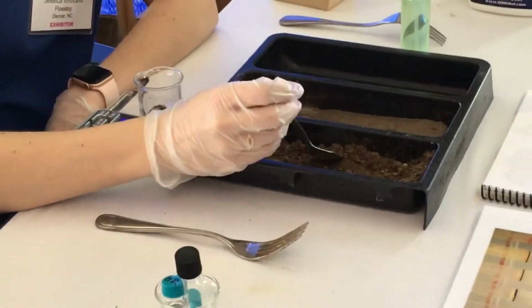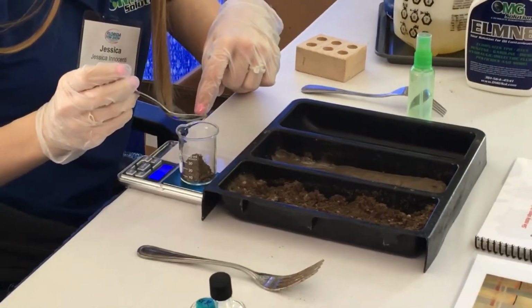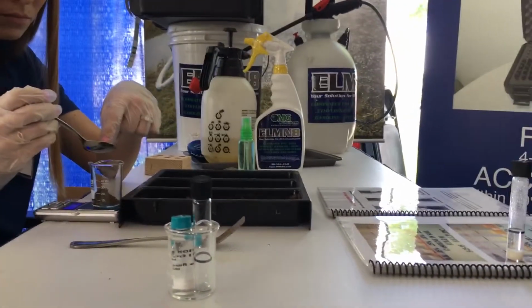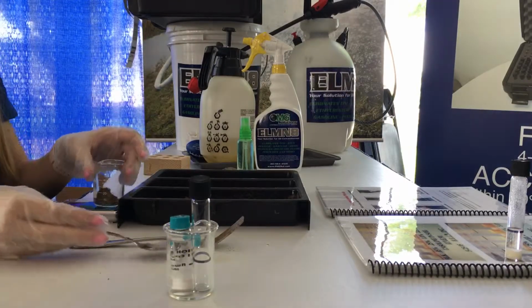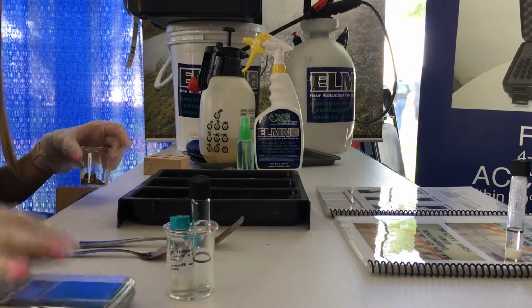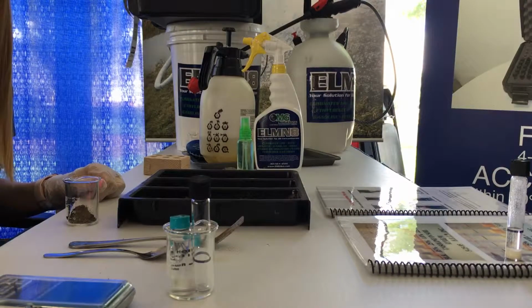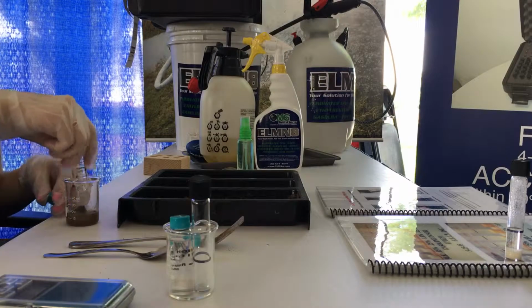So again, going through our simple process of doing a soil analysis, measure out 5 grams of soil. You put your scale on, you put your empty beaker, you hit the tare button, which takes the weight of the glass out of play, and then you measure out your 5 grams of soil. Then you grab our extract solvent and you pour it into your 5 grams of soil sample. Pour the entire contents in there.